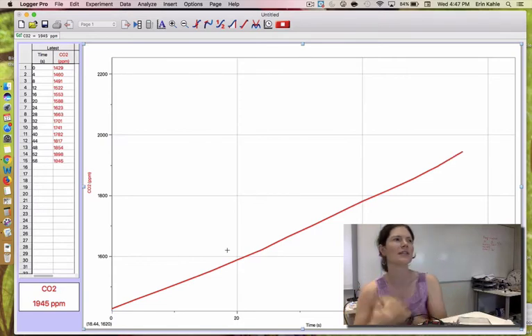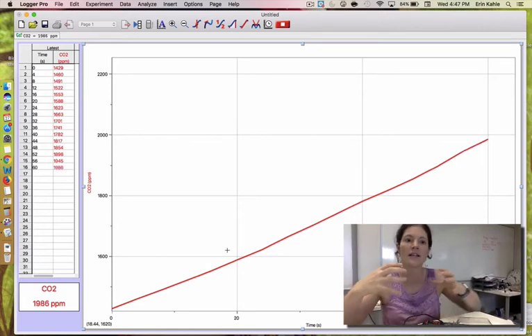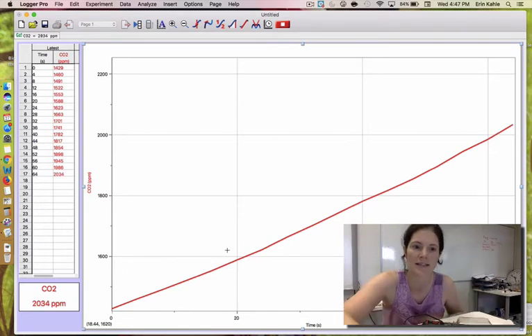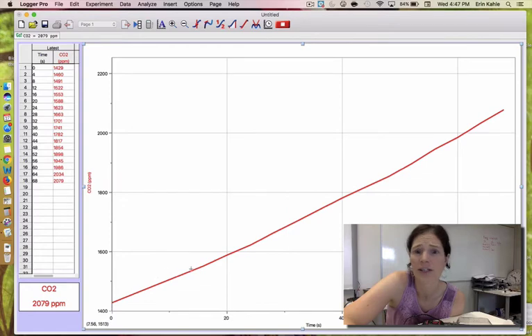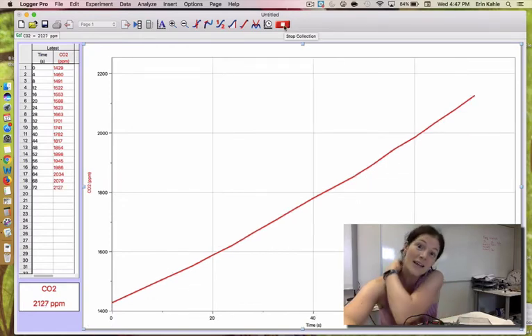Unless you're using the light probe, it could be that a leaf in light would be producing more or less O2. I showed you guys that example the other day. But for this, if I say, look, there's a consistent rate, so I'm going to show you guys how to analyze this.